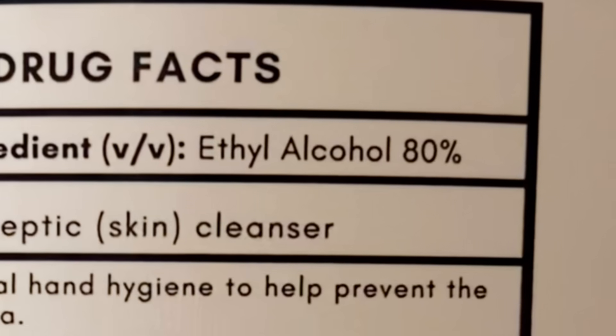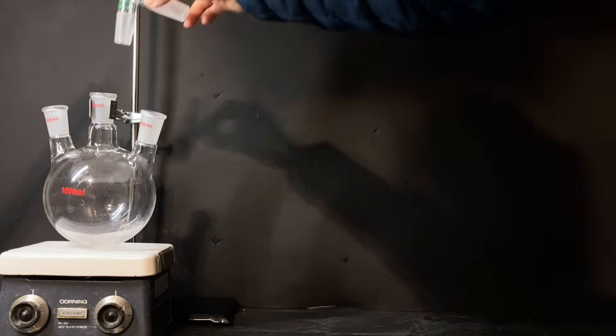Now you might be asking, how do I even extract the ethanol from this mixture and leave behind the other three substances? A simple distillation is going to be a step in the right direction. So let's get this set up.